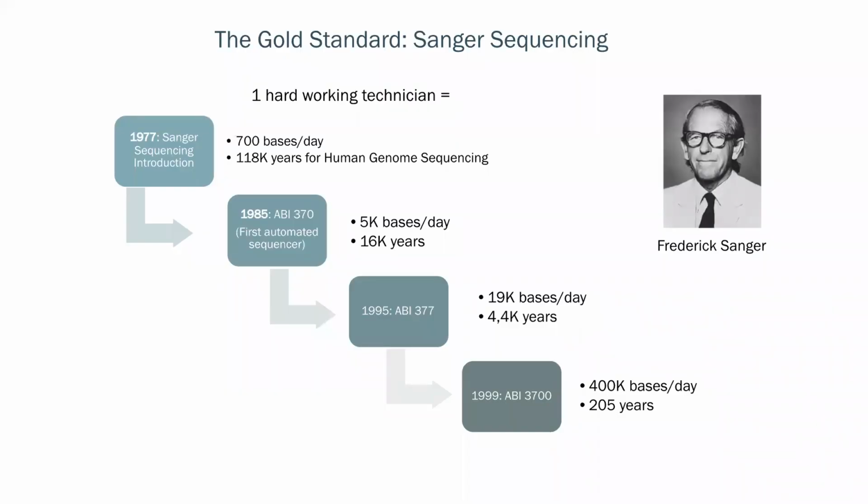Sanger sequencing is a first-generation DNA sequencing method. Despite the advantages of next-generation sequencing techniques, where throughput is orders of magnitude higher, Sanger sequencing retains an essential place in clinical genomics for at least two specific purposes.